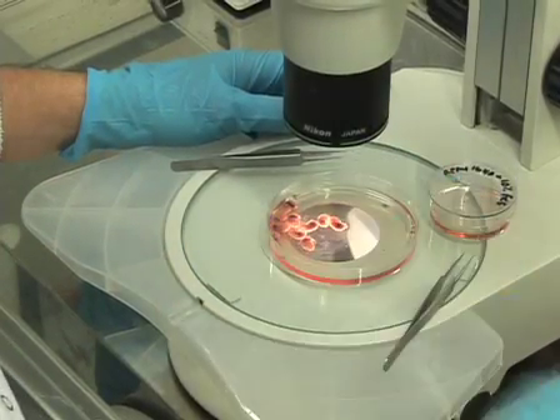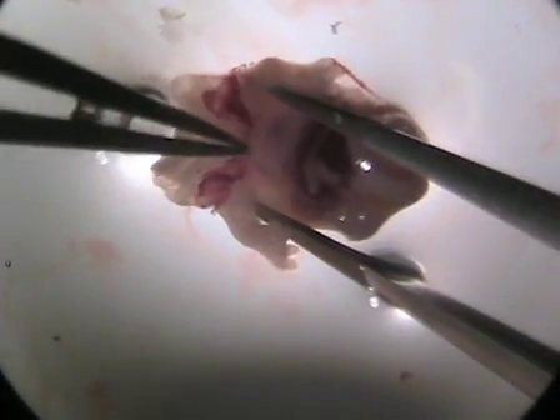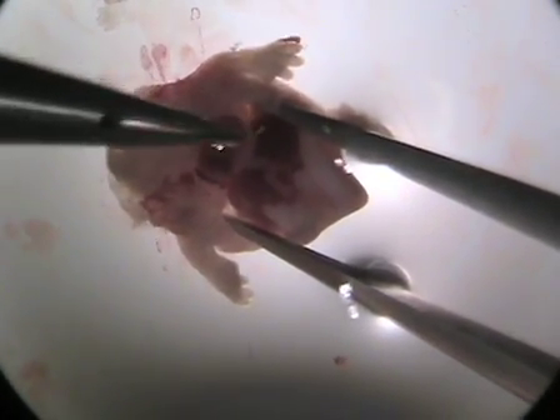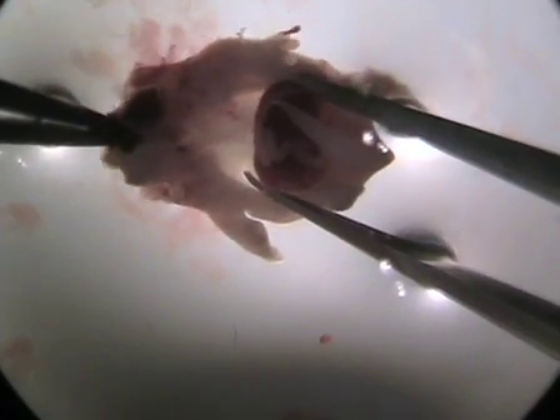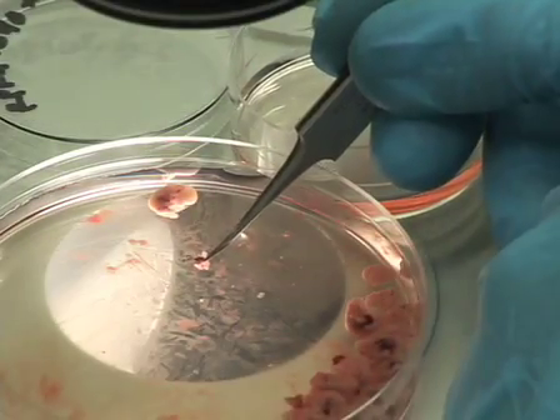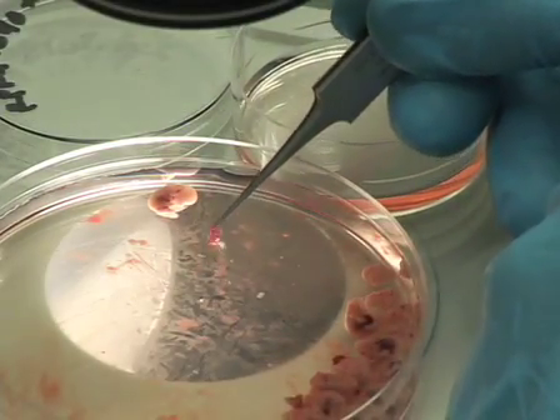Under a dissecting microscope with the embryo submerged in medium, decapitate the embryo using forceps. Open the anterior surface of the chest wall by placing the tips of a closed pair of forceps into the chest cavity and open the forceps to reveal the internal thoracic cavity. Remove the entire thoracic tree — heart, lungs, trachea and thymus — by grasping gently below the heart and place into a 35mm dish containing 5ml of RPMI 1640 plus 10% FCS.